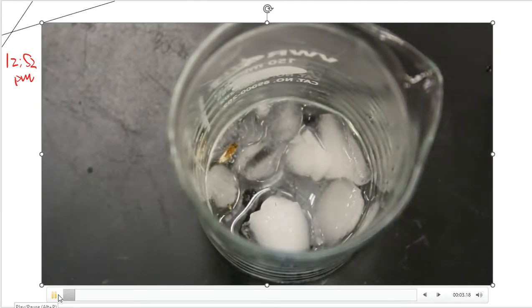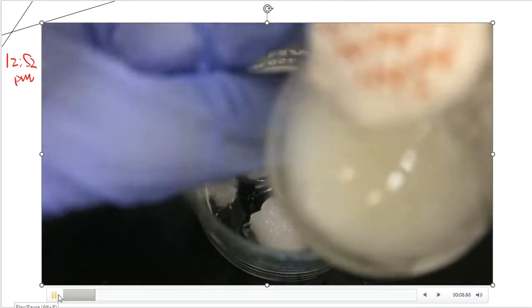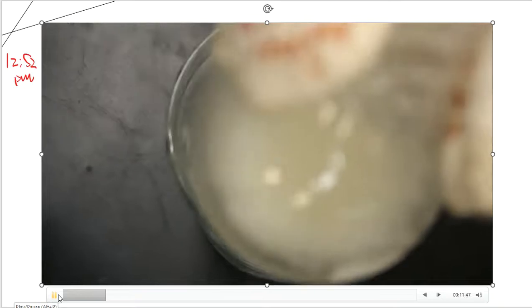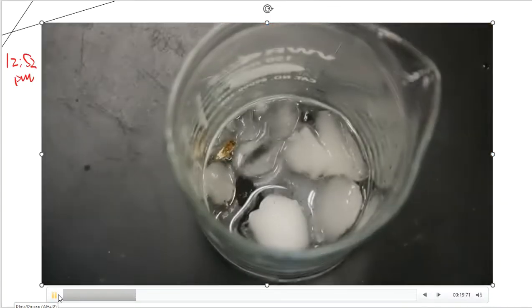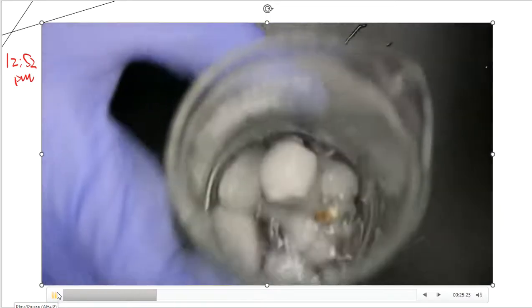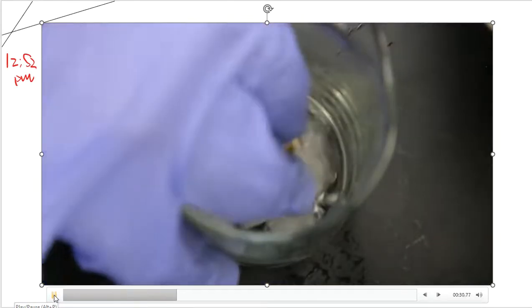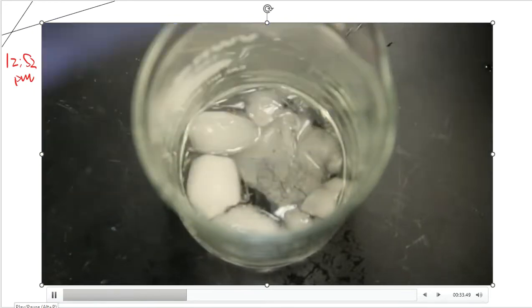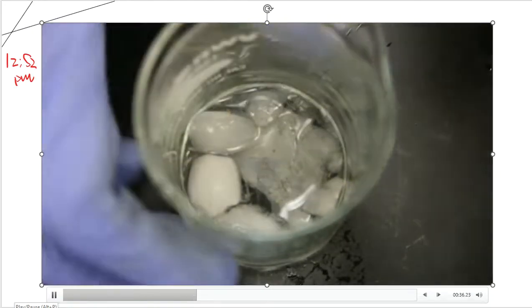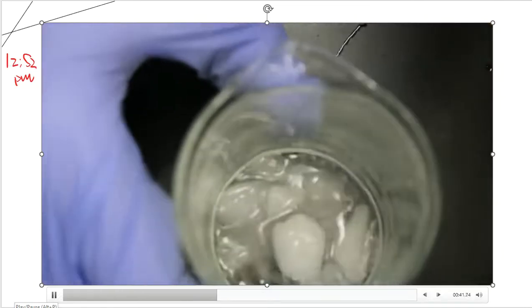All right, the next step tells me to take my reagent that's in the boiling flask, and that's right here. You can see once this comes into focus, it's still that milky, kind of buttery looking solution that we had in the boiling flask all along. Then it tells me to slowly pour that over 10 grams of crushed ice, and that's what you're seeing here on the screen. Well, first, it looks like some crud is there, so I'm going to get rid of that. It says to slowly pour it over the cracked ice, and that's what we're doing.